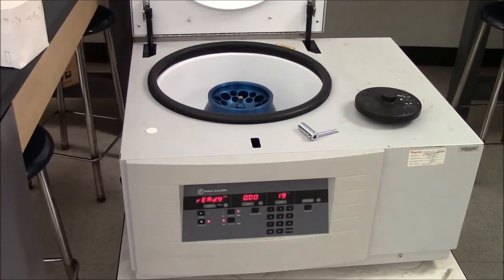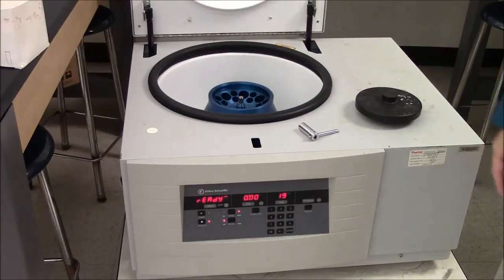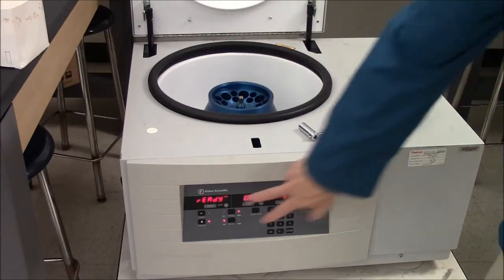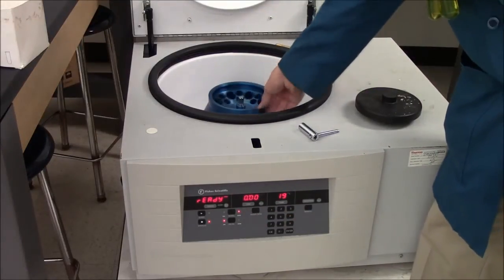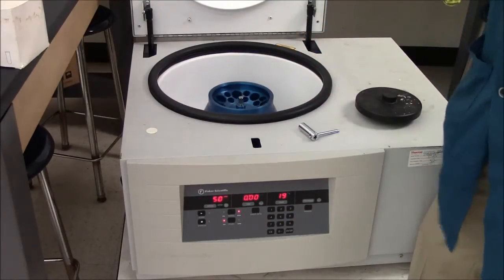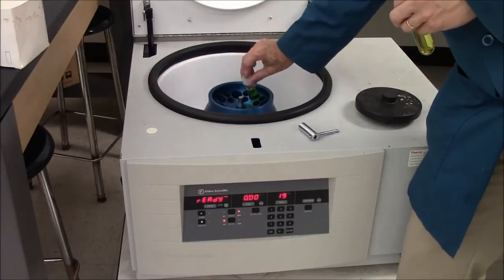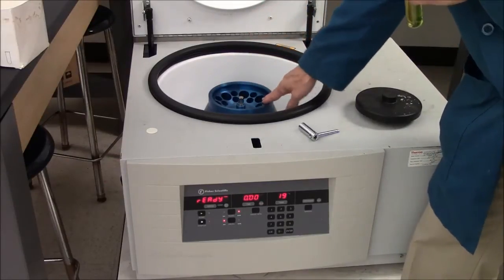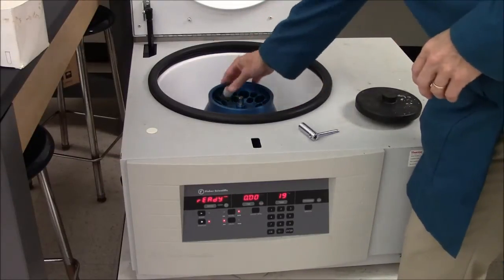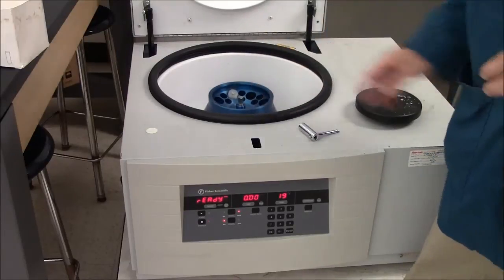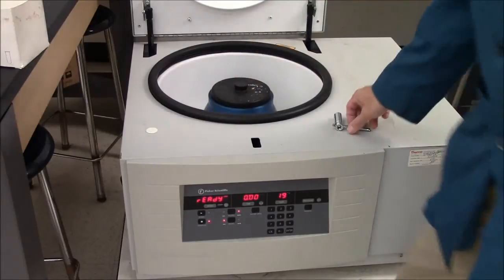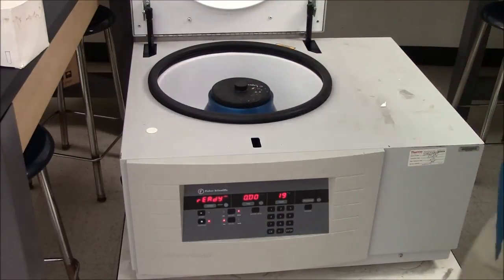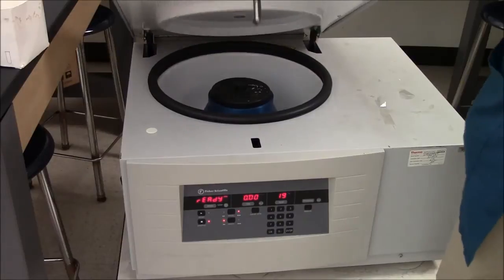This is the centrifuge we'll be using. It's a Marathon centrifuge. It has a control panel here, and inside there's this rotor. Always need tubes opposite each other. So there I've got my balanced tubes opposite each other. The rotor has a lid.